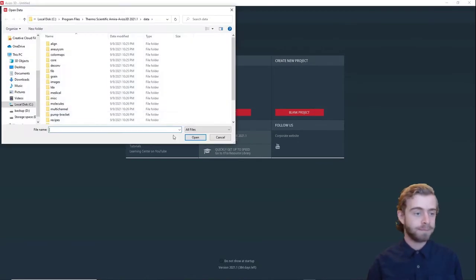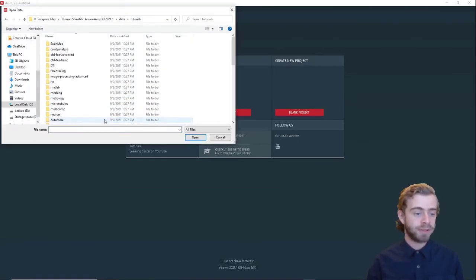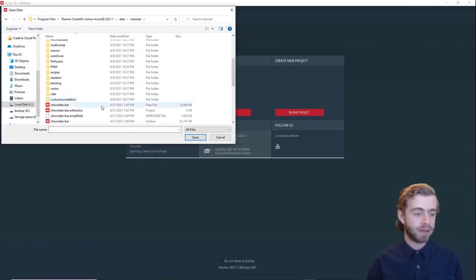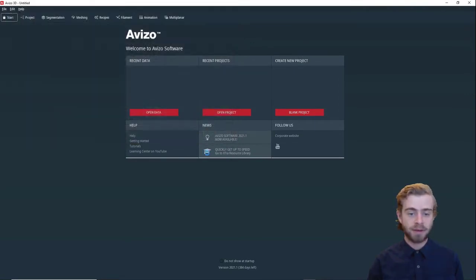So we're going to click open data and we're going to go down to tutorials, down to chocolate bar, and we're going to open it like so.